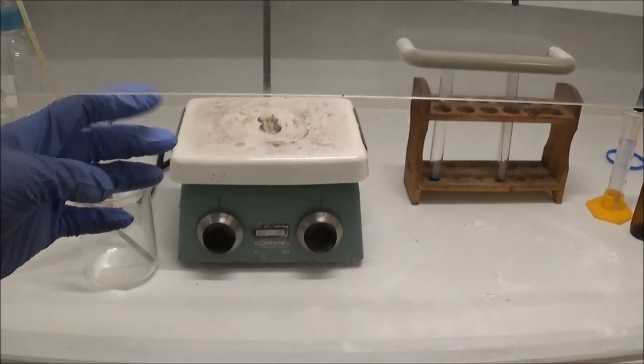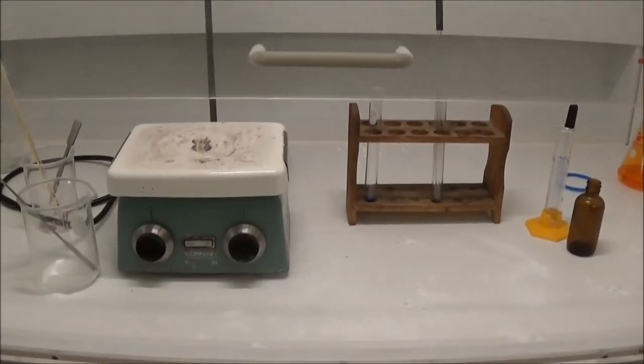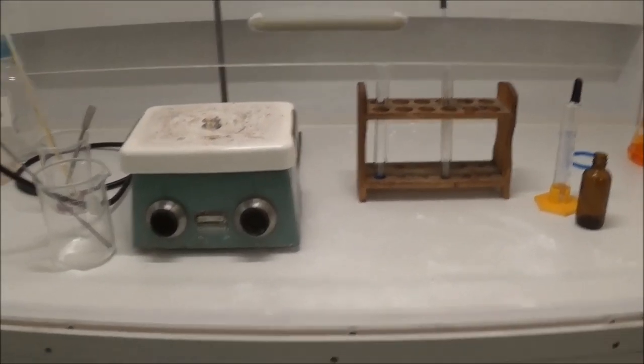Soon, if I get around to it, I'm going to drill a large number of holes along the top here at different heights. Because I find that with the air coming in through the bottom down here, there's a lot of swirling air currents up near the top, which take a little longer than they should to pull the air out. But other than that, it's fine.